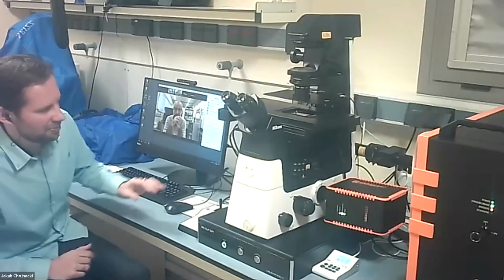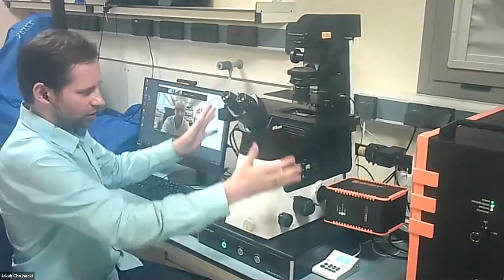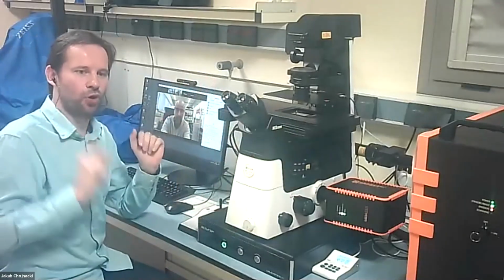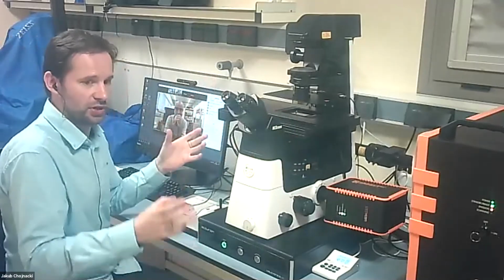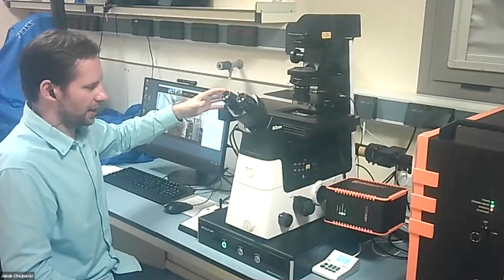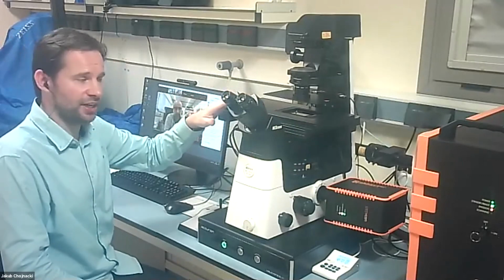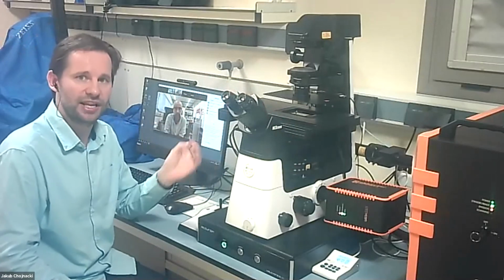And she's asking whether it would be possible to program the microscope so it acquires multiple samples automatically, like high throughput for many sample acquisition. Oh, absolutely. There are special add-ons to this type of microscope called sample hotels, where you put in a lot of samples, and a robotic arm or a slide holder puts the samples in, images them, then grabs another sample and puts the next one.